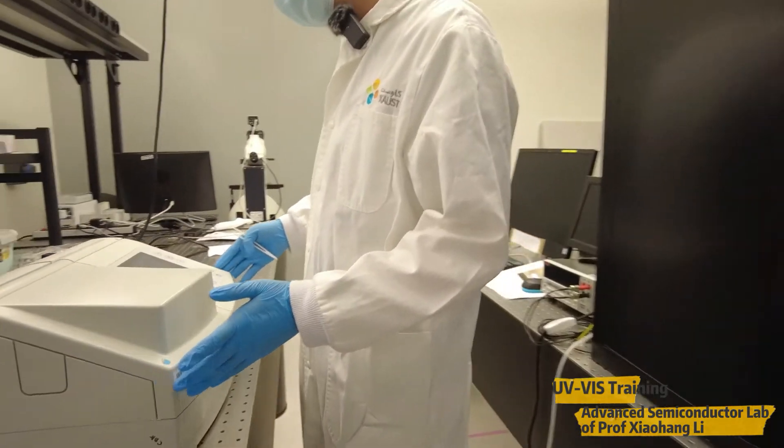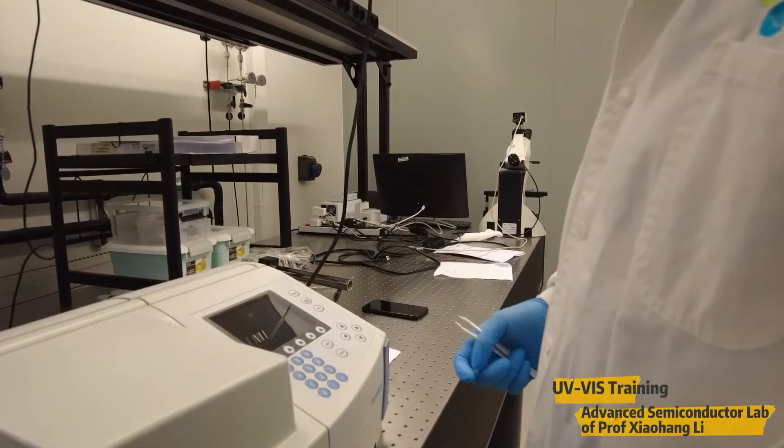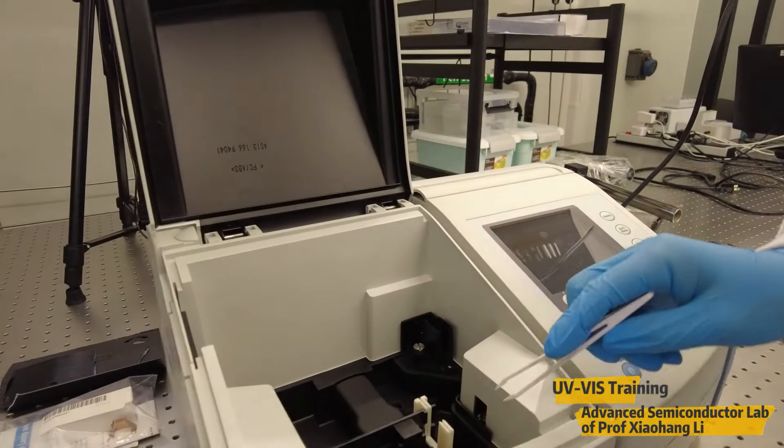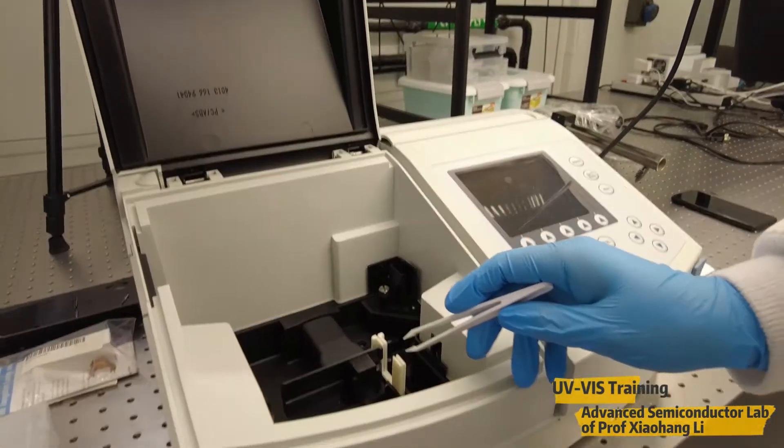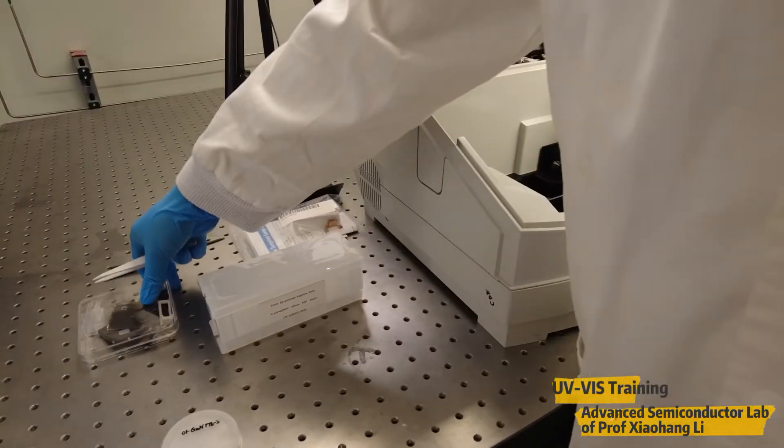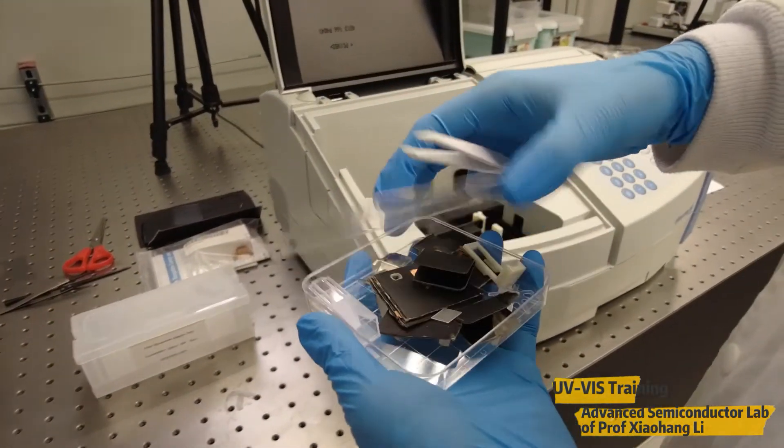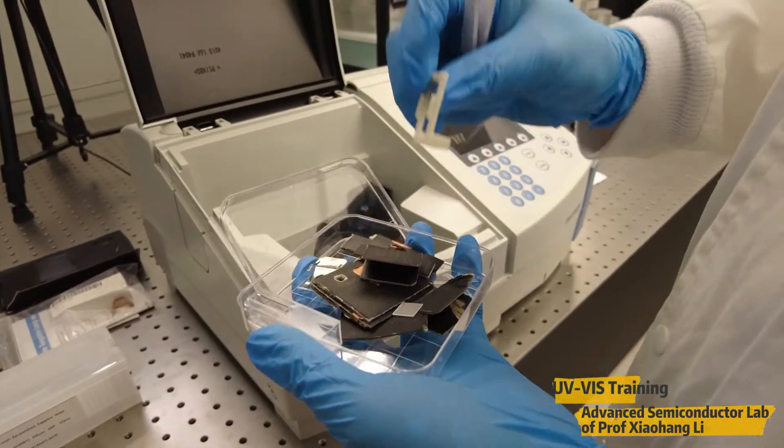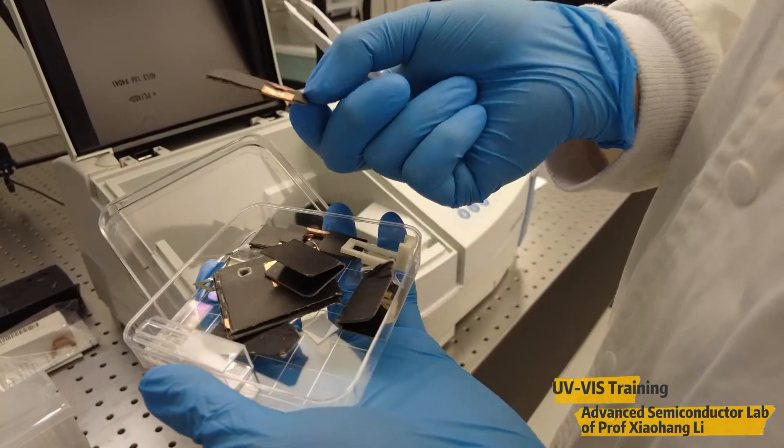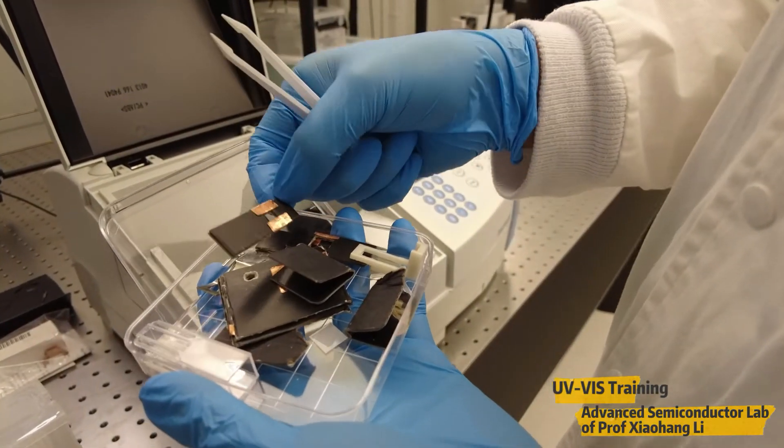This is the UV spectroscopy that we use. Here we are going to use one sample holder which we made ourselves. This is for the 2 inch. We also have other sample holders that we made such as for 1 by 1 centimeter, 0.5 times 0.5 centimeter square.